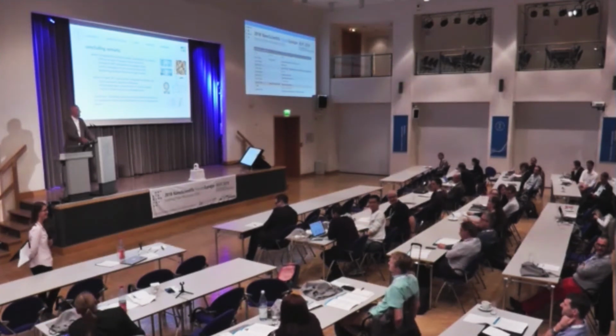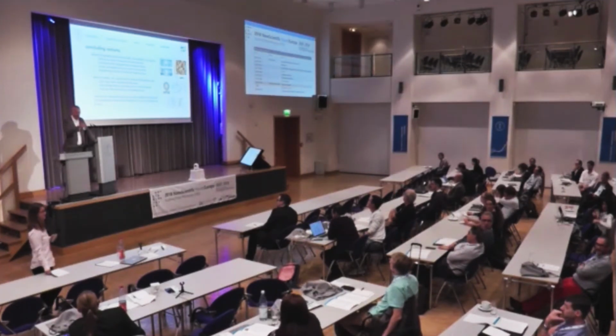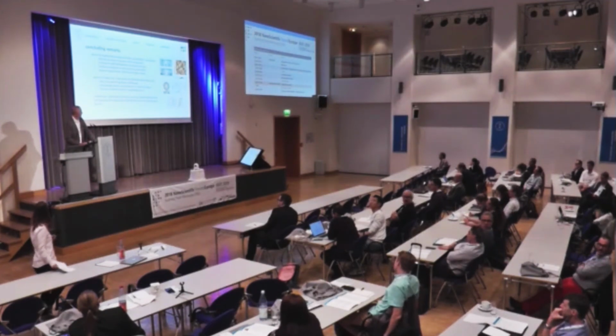In this AFM image, do we see nanobubbles or are there none? Do you look at them? In this picture, you mean? No, this is just roughness. But nevertheless, also on those rough surfaces, we are able to detect nanobubbles. But I will refer to the talk of Lisa Ditschelein tomorrow. She will give you a deep insight into how to detect nanobubbles on rough surfaces and to distinguish between topography and bubbles.